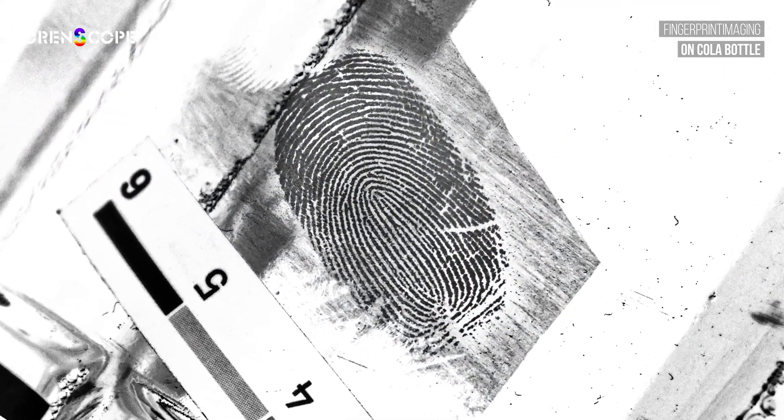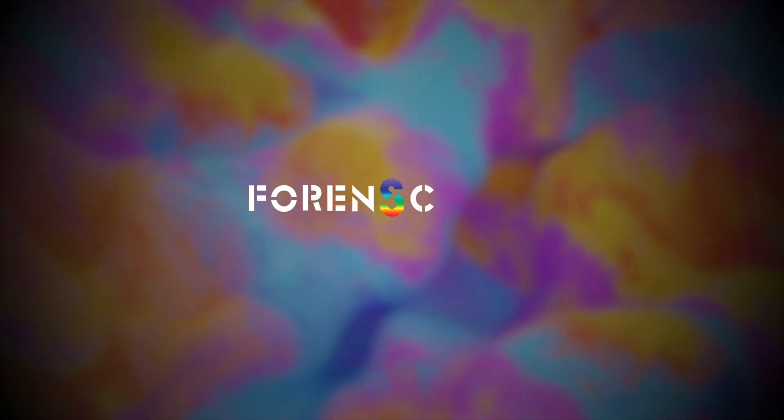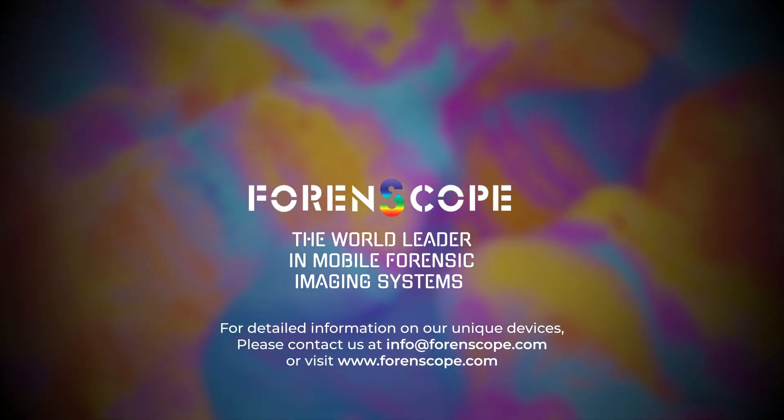Contactless Lab Ultra, where cutting-edge hardware and software unite. Maximum evidence, minimum expertise. Forenscope, the world leader in mobile forensic imaging systems.